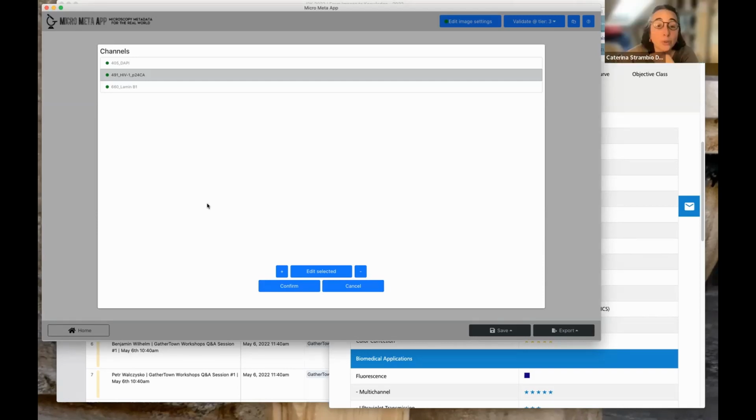We are actively looking for additional funding to do a lot of this. With Claire, we are working to get CZI funding to do some of this. I'm also working, hopefully, to get some NSF funding with the core marketplace people and the RRID people to be able to build repositories of microscope configurations. And then we are working with the manufacturers to make sure that, not immediately because that takes time, all of this will be made automatic.